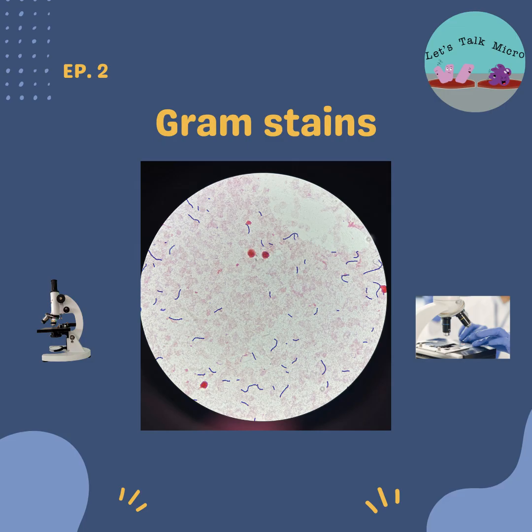Because you have to keep in mind that you can either under decolorize or over decolorize. So if you under decolorize, your end product, which was supposed to be pink, stays purple. If you over decolorize, your end product was supposed to be purple, but you end up with pink. And this is definitely important, as is the bacteria. There's a difference between gram-positive rods and gram-negative rods. They have intrinsic antibiotic resistance, so you don't treat them all the same. So you have to make sure that you're doing a proper procedure so you can report the proper gram stain.